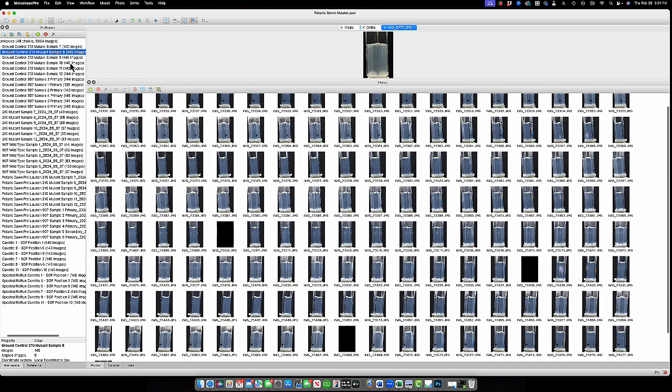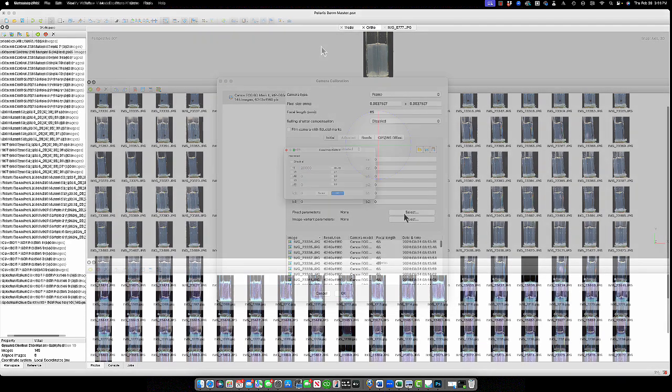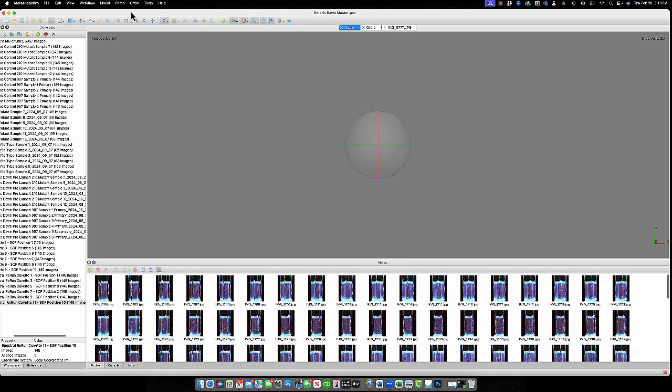So now this is going to be kind of a tedious process. As I said, I have to do this for all of them. So let me go through, finish these up, and then we will move forward with our batch. Okay, all of the lens parameters have been fixed. So now we're ready to go ahead and get started with our batch.